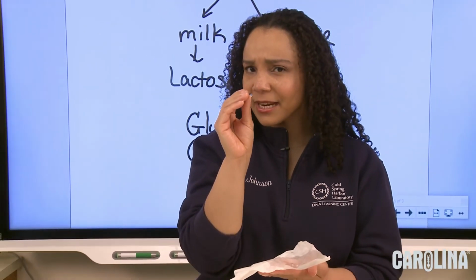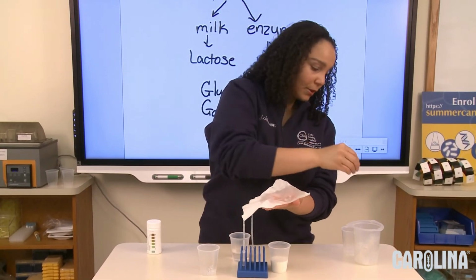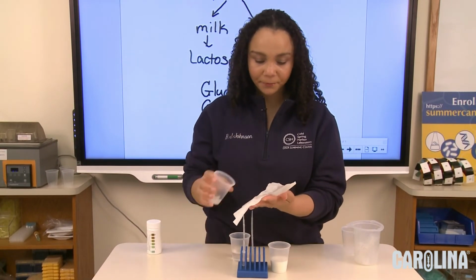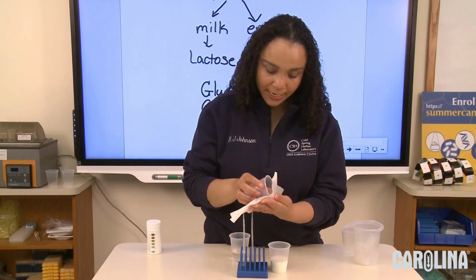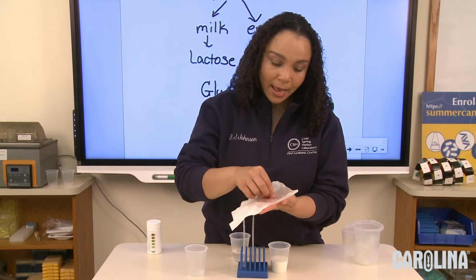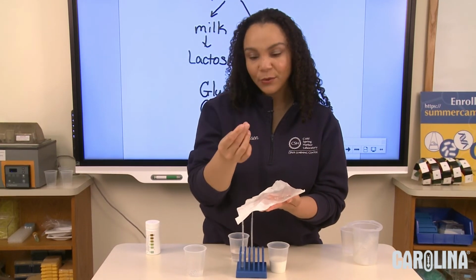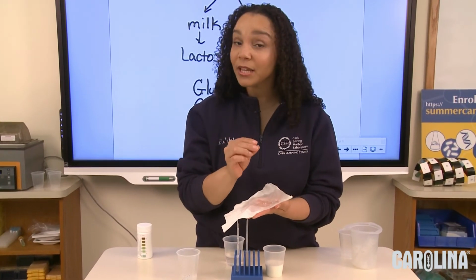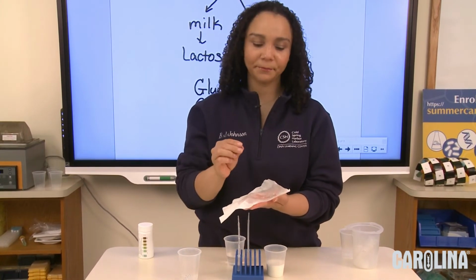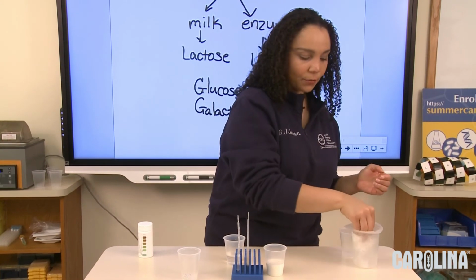Now, do you think now that I've touched this, I'm going to put this back into my cup? No. I'm going to put that in the waste beaker. I'm going to take the lactase spheres I didn't touch, and then I'm going to grab one. When you are looking at these spheres, you can squeeze them, they're a little squishy, but remember they have enzyme on them, so don't put them near your eye. After I finish, I'm going to throw this in the waste beaker.